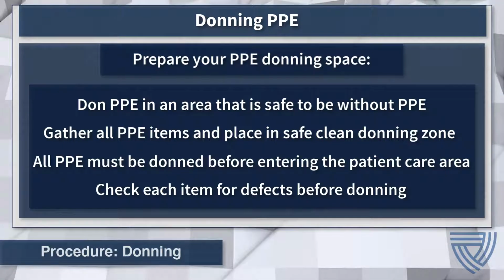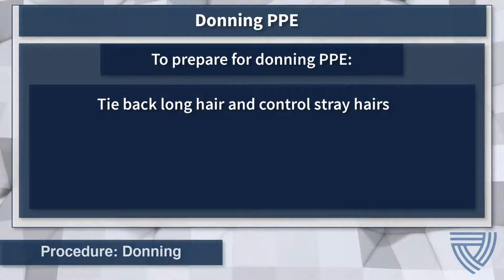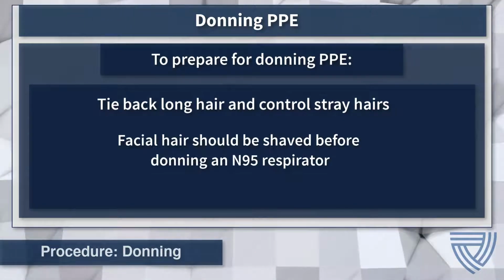Check each item of PPE to ensure there are no defects such as rips in the gown seams or creases on the face shield. Staff with long hair should tie it up in preparation to don PPE. Staff with facial hair should shave in order to wear an N95 respirator.